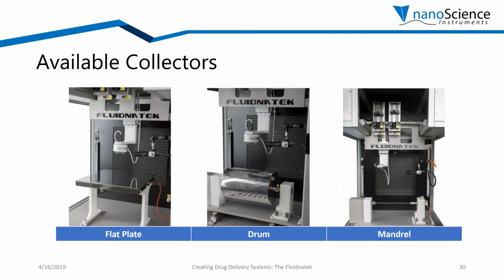A rotating mandrel can also be implemented for different applications like tissue engineering. So for example, researchers are using these mandrels to create beautiful artificial blood vessels. This can later be implanted in a patient as needed.